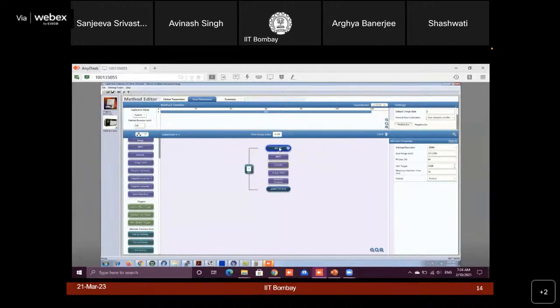In the MS Orbitrap mode, whatever the default charge state is, it is set to 1. Here we are using an Orbitrap resolution of 60,000, but it is capable of going to 5 lakhs. You can see around 2.4 lakhs. Here it is 5 lakhs of resolution. The scan range we are using is from 375 to 1800. The RF lens is 60.